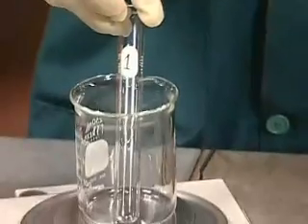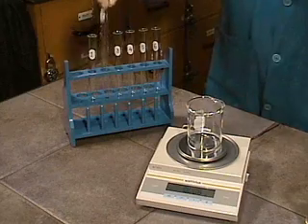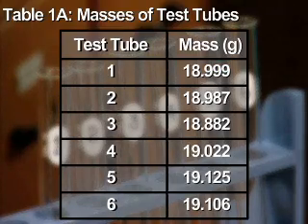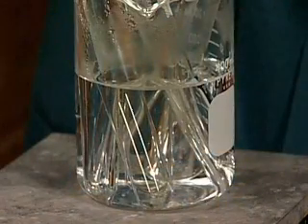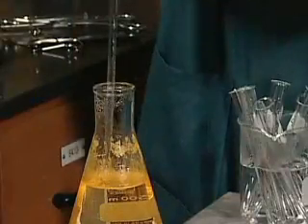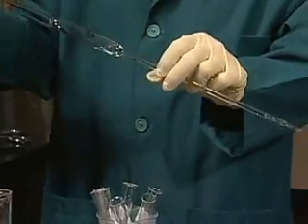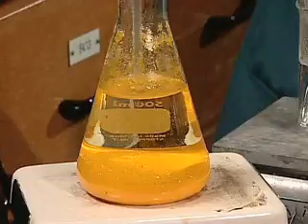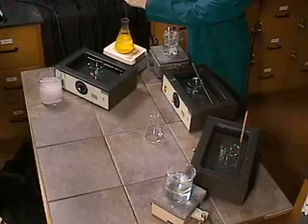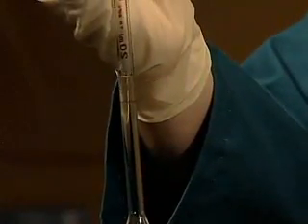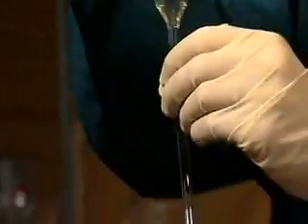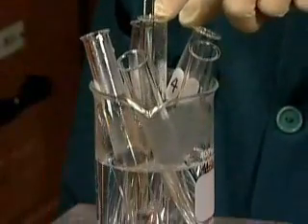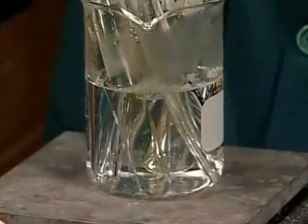The individual mass of six empty test tubes is determined. The test tubes are placed in a hot water bath. Using a warmed and rinsed pipette, exactly 20 milliliters of the hot-saturated solution are transferred into each of six test tubes. The assumption is that each test tube contains an equal amount of dissolved solute.